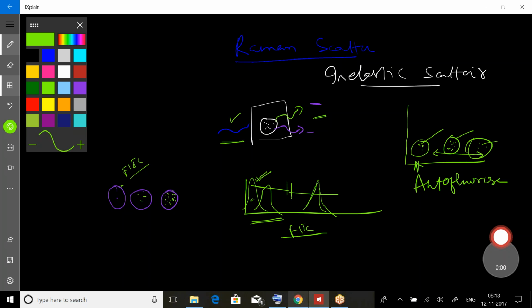So I conclude part 2 of my lecture series, and in part 3 of the lecture series I'll be talking about how these different measurements are obtained. I will talk about the anatomy of the flow cytometer: in order to measure all these things, what a flow cytometer needs to have.